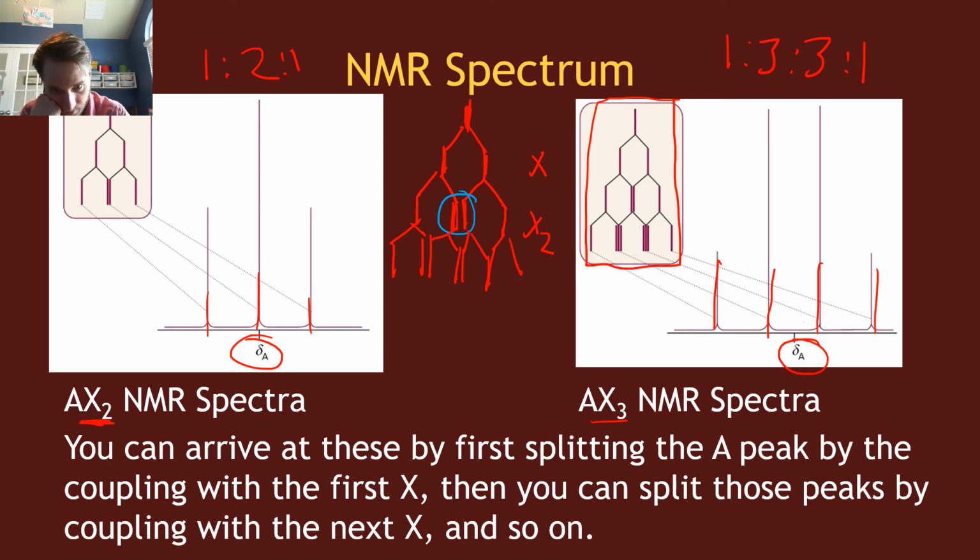Sorry, I introduced way too many peaks here. So this splits out, this splits in, and then there's another one that splits there, there, and there.